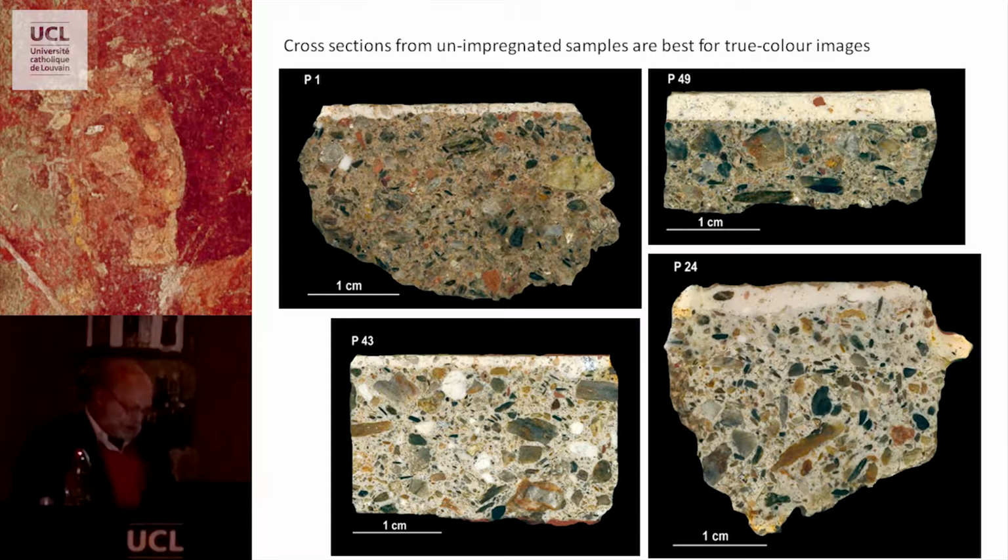What we can see here too, these are big lumps of lime. They give us much information about the production of lime in the slaking process. This is obviously not lime putty from a pit, but a kind of dry slaked lime used here. And they are present just in the richer layer, but not in all of the samples.